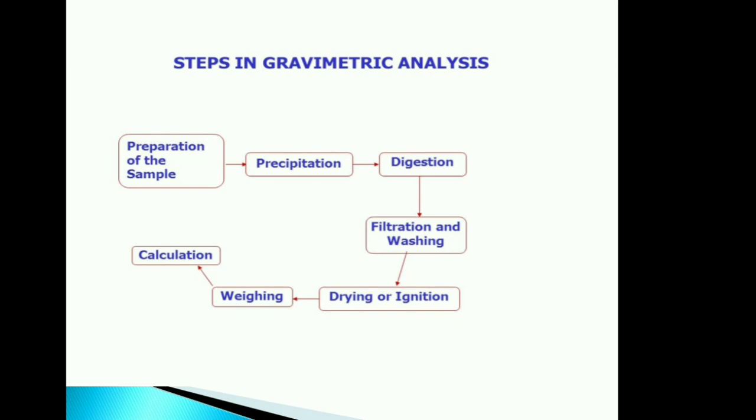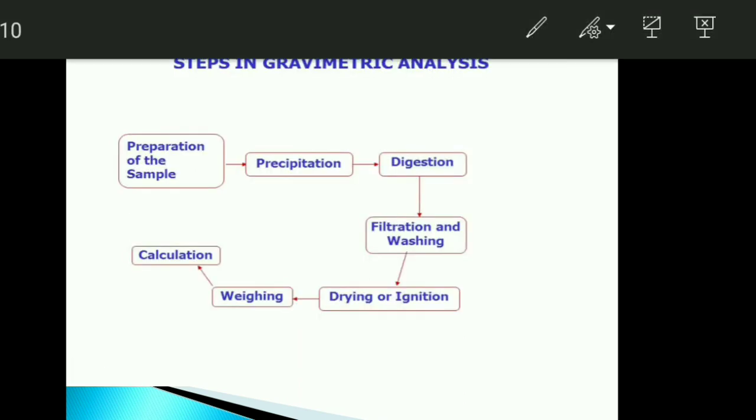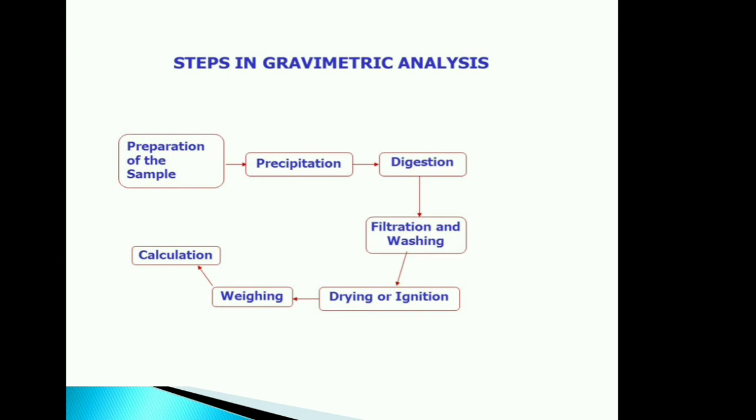So student, this process you have to perform in the practical. Generally in the inorganic chemistry practical you perform the gravimetric analysis process, and you carry out this process practically, and at that time you get very good knowledge of the incineration process practically.